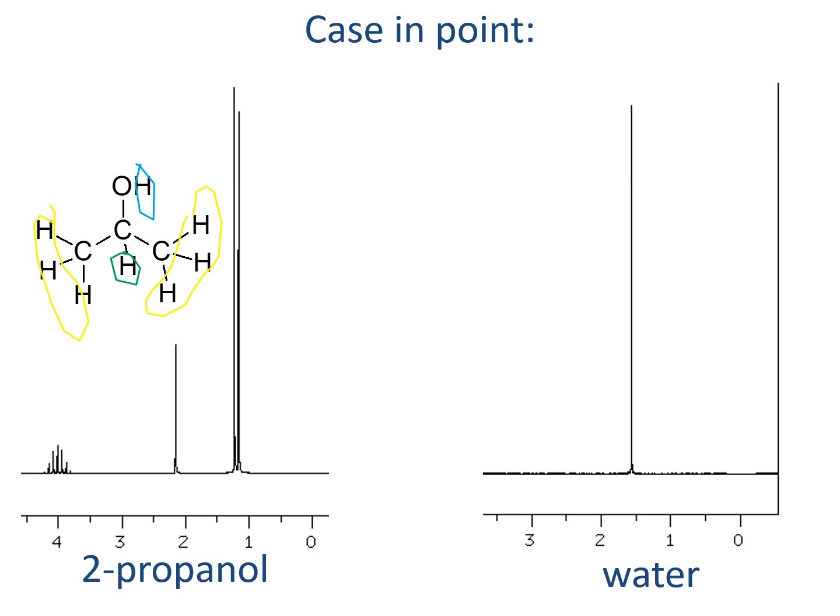If we look at water, water doesn't split at all. Water actually in most instruments shows up as a really broad peak. And so this peak right here, which has an H on an O, it's actually really similar to the H on an O that's present in water. And so these peaks will overlap.